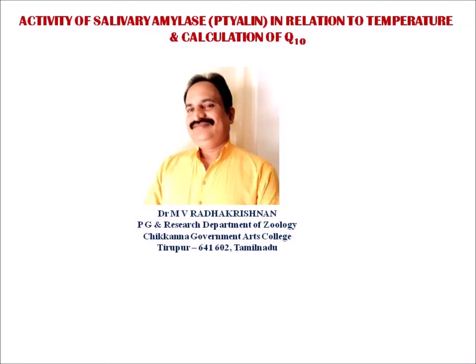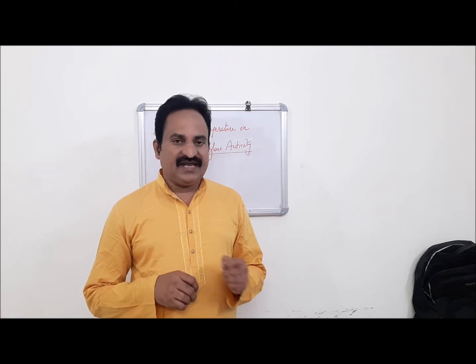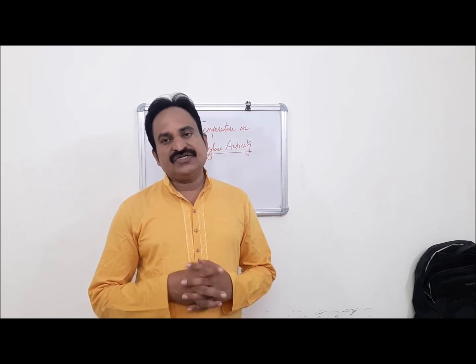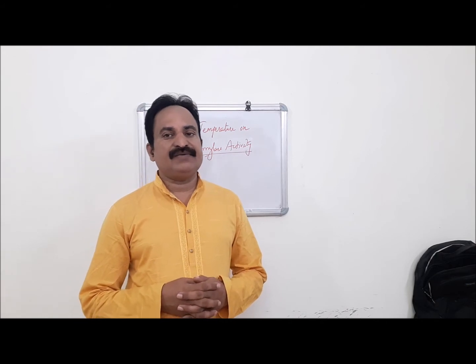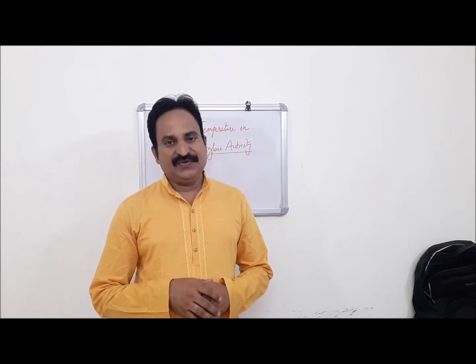Dear students, the topic is activity of salivary amylase or ptyalin in relation to temperature and calculation of temperature coefficient. To determine the rate of activity of salivary amylase or ptyalin on the digestion of starch with the effect of temperature using Scales' sugar titration method and calculation of temperature coefficient Q10.